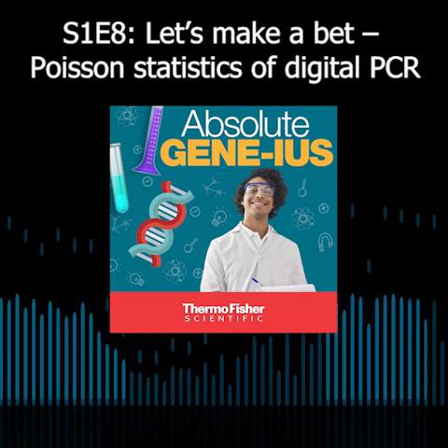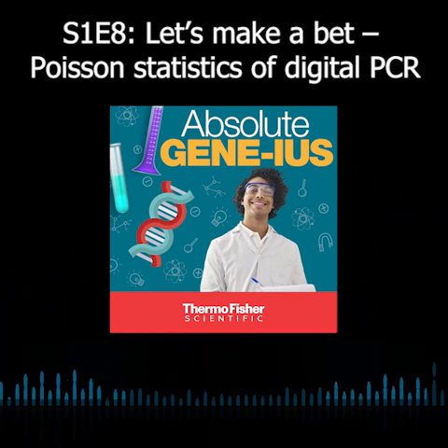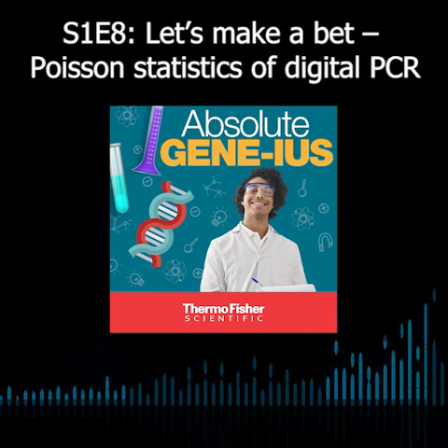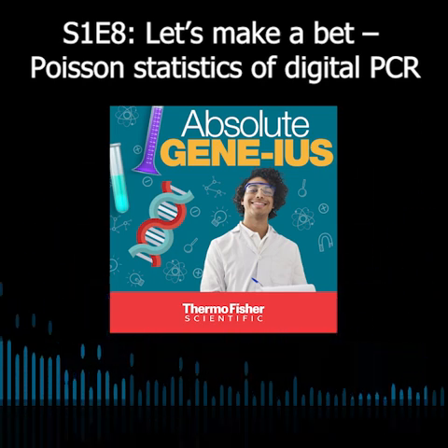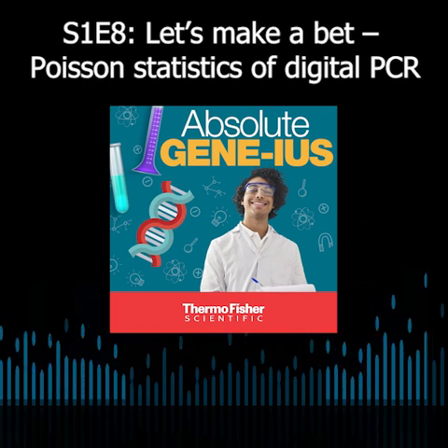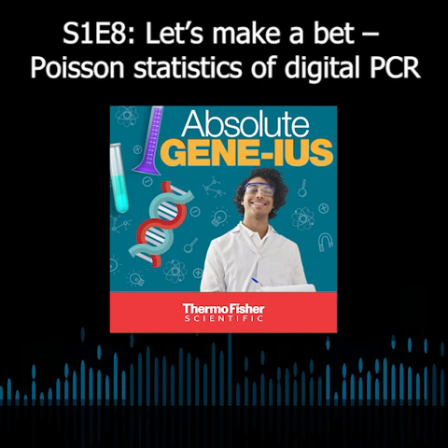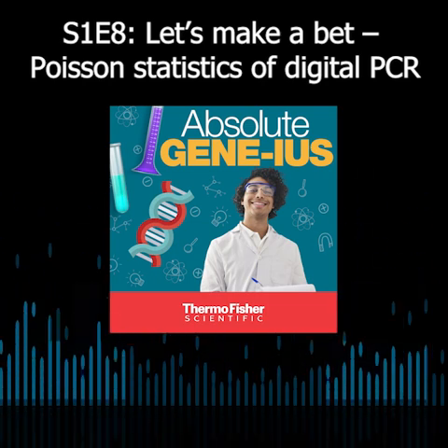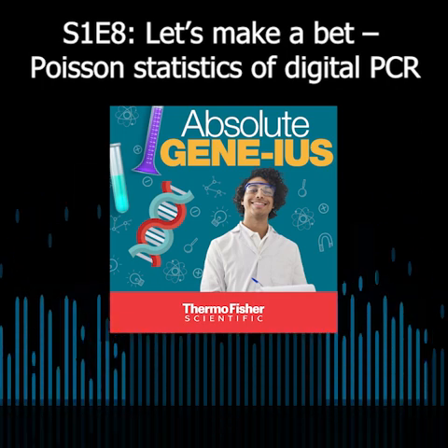Interesting. Sounds like you're describing Poisson statistics. Is that the word for it? Poisson statistics is what we need for digital PCR, because all we can measure is how many are bright, how many aren't. And then Poisson distribution, Poisson statistics, lets us convert that measurement, that observation, into our concentration. How is that applied then? Is it just a straight percentage factor that gets added on to that yes/no number to give you a little bit more accurate concentration? There's a formula.